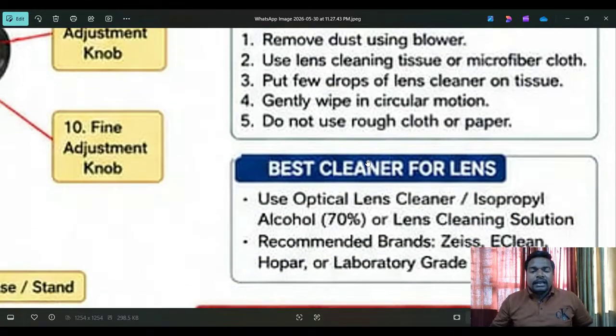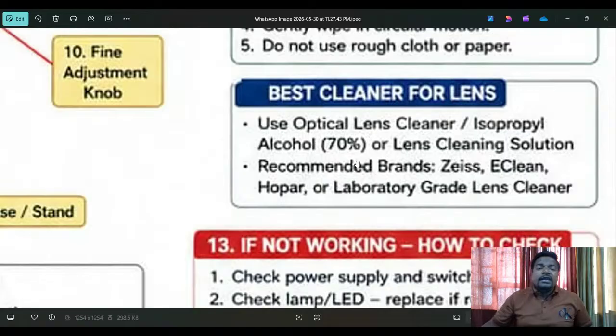Sometimes in colleges and medical colleges, hundreds of microscopes are there, and hundreds or thousands are also available in large medical hospitals. At that time, if you follow one by one, you can do a minimum of 20-30 microscopes per day and resolve the issues. But before that, you have to know what to do and what not to do, and keep every point in your mind. It's a matter of a fraction of a second. You have to be clear. Okay. Right. Biomedical engineers, listen carefully. This is for awareness purposes.